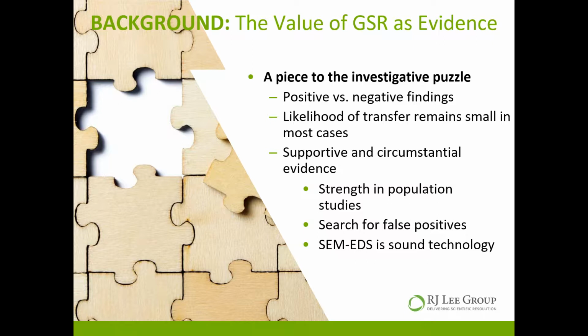Conversely to a positive finding, a negative finding doesn't necessarily mean that a person was not in the vicinity of a firearm. It only indicates that there was no residue found on this item. So a negative finding isn't necessarily a bad thing.